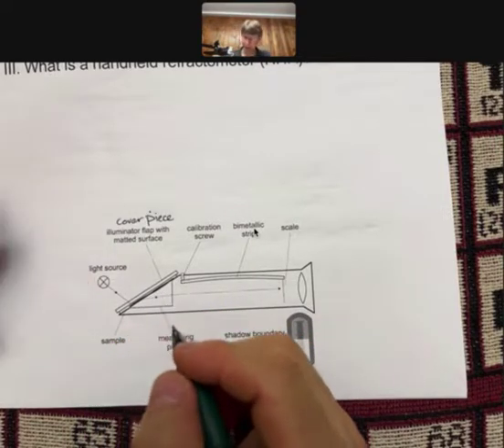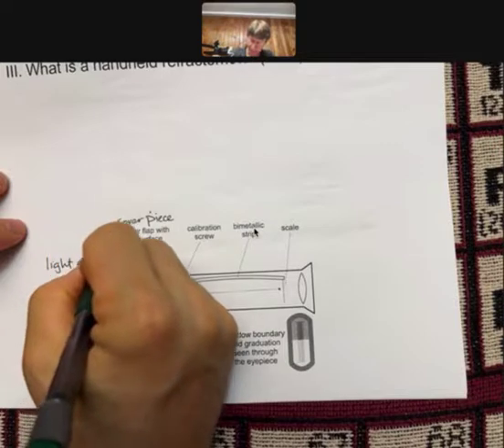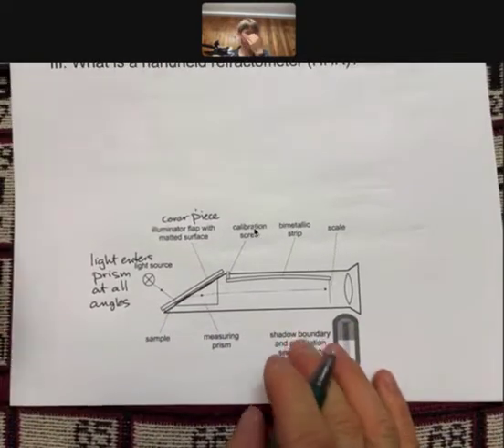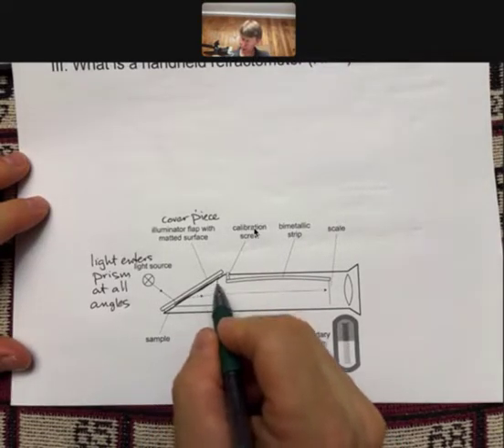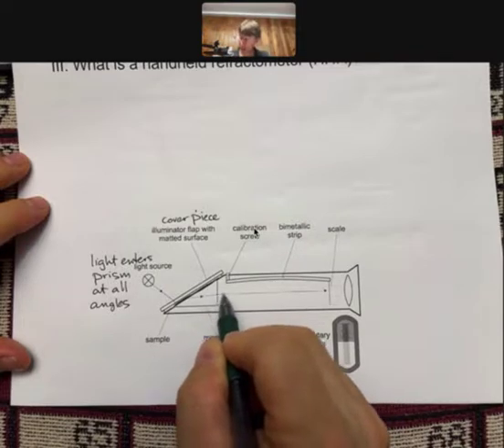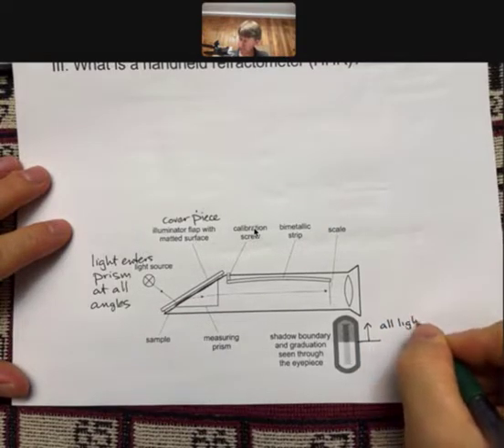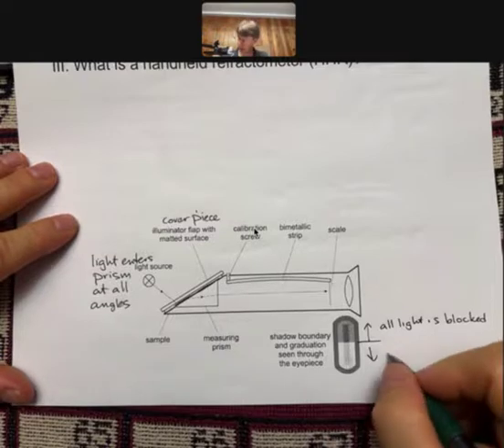Light, unlike Snell's law where there's one angle, will be coming at all angles — so light enters the prism at all angles. That is one difference between Snell's law, as we were talking about before, and the handheld refractometer. Light is going to come through here at all angles, be refracted at this prism surface, and come down here. What you're going to see on the scale is that above a certain line all light is blocked, and below that, where it is lighter, all light goes through.